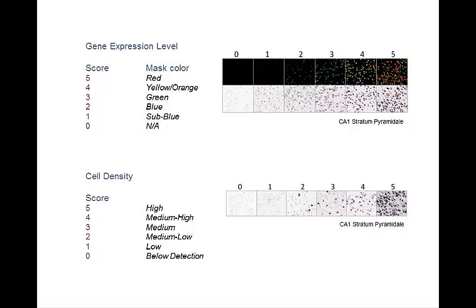Gene expression level utilizes our color mask tool and is ranked by color. Five is the highest expression and represented by the majority of the cells showing a red color, four by predominantly yellow colored cells, three by green cells, two by blue cells, one by sub-blue cells, and zero by no discernible expression. Cell density is rated on a scale of zero to five as well, with the density of expressing cells indicated as on this image.